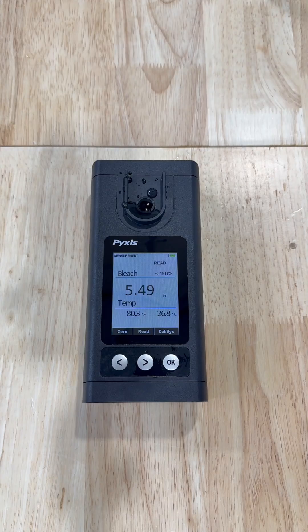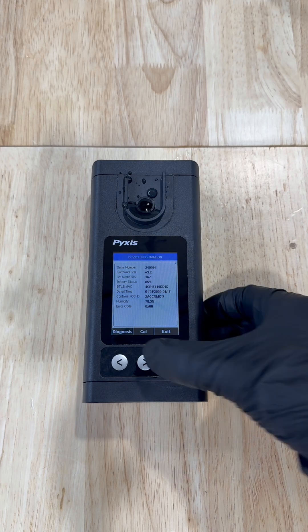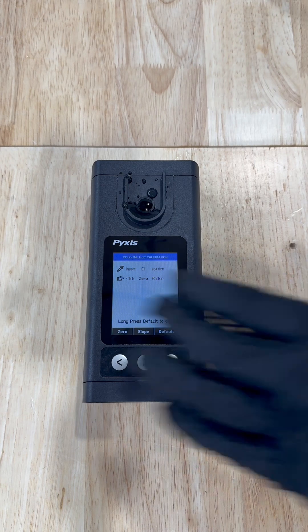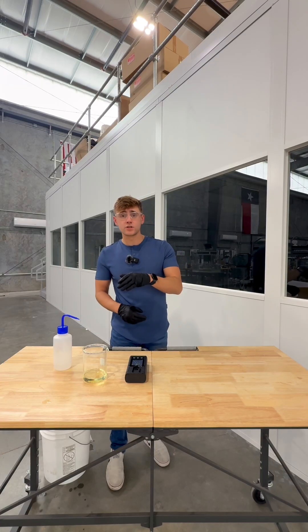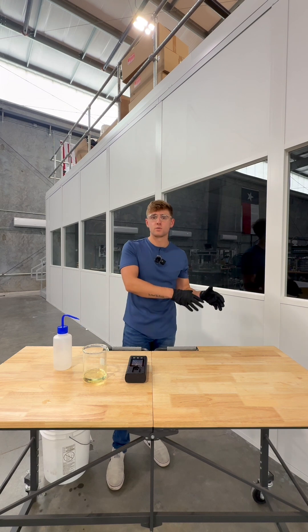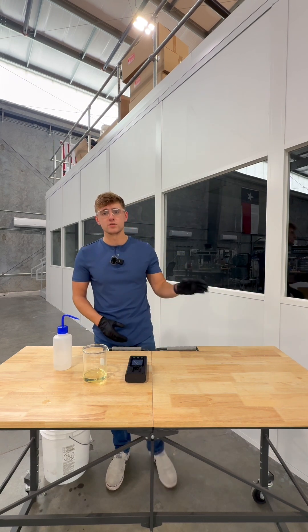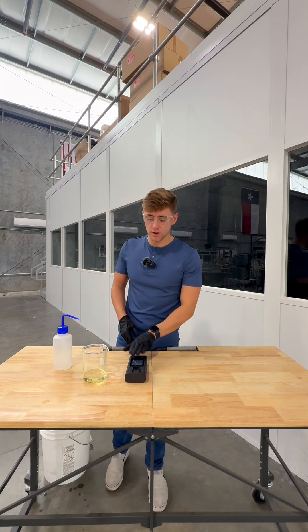Calibration is also super simple. You would do a zero with DI water, and then you can calibrate to a known 1% sodium hypochlorite concentration, whether that's something that you find on the shelf or something that you have in-house. You can also calibrate to your titration method residual — conduct your titration method, get your residual, and then use that as a calibration point for the handheld device.